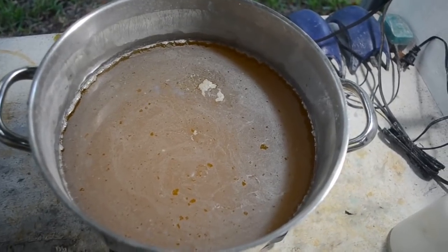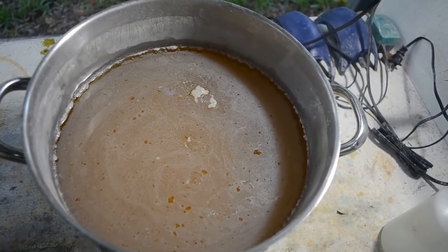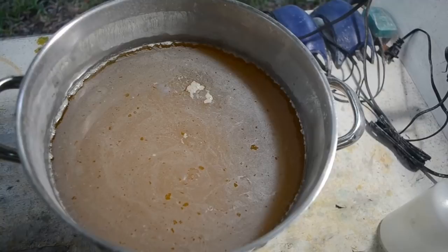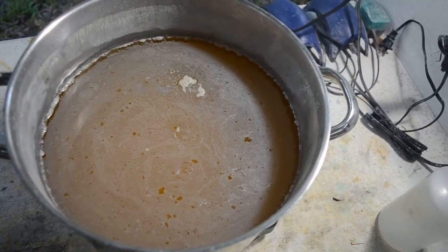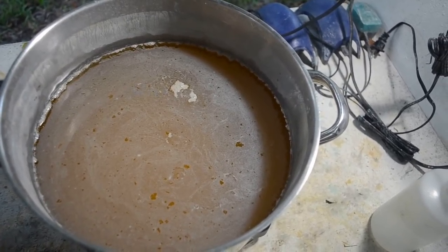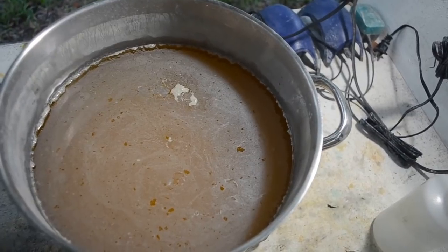So here it is. It's been a few hours. It's all settled down pretty well. It looks like there's a little scum of zinc floating on the surface, but most of it has sunk to the bottom, along with whatever that white precipitate is, probably silver sulfate, I would imagine. So it's getting late in the afternoon. I gotta start cooking dinner shortly.